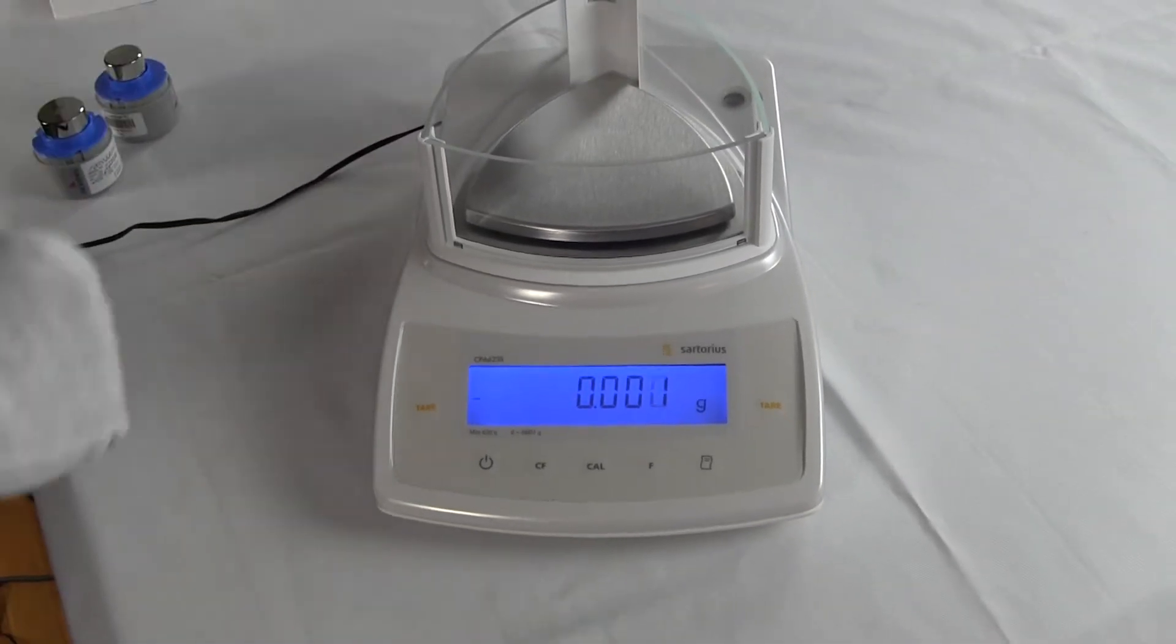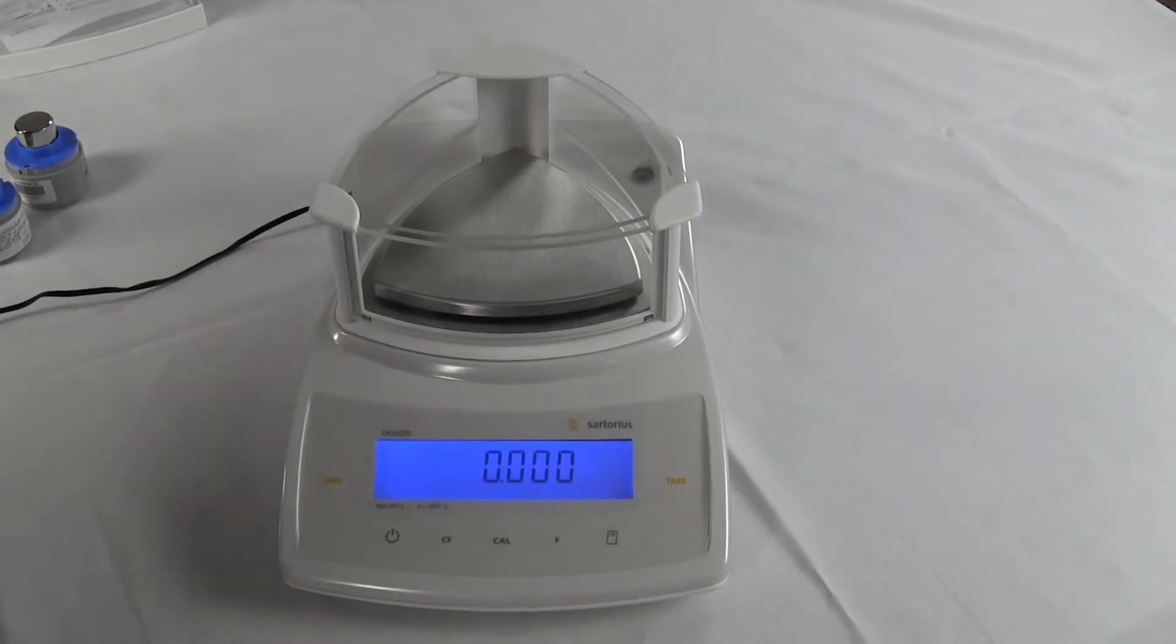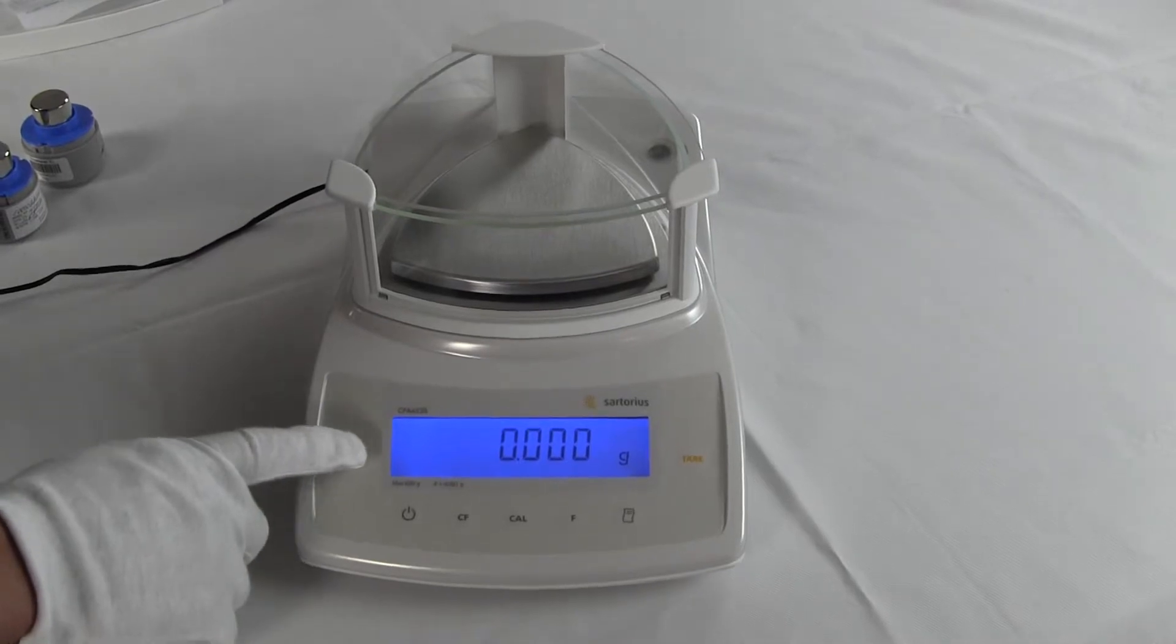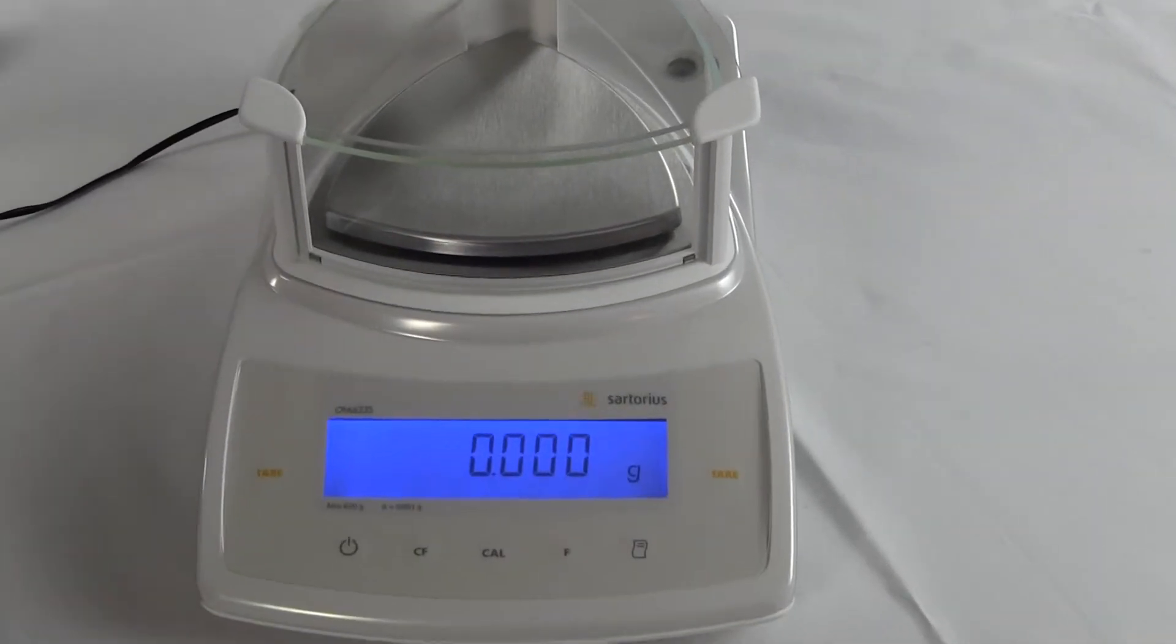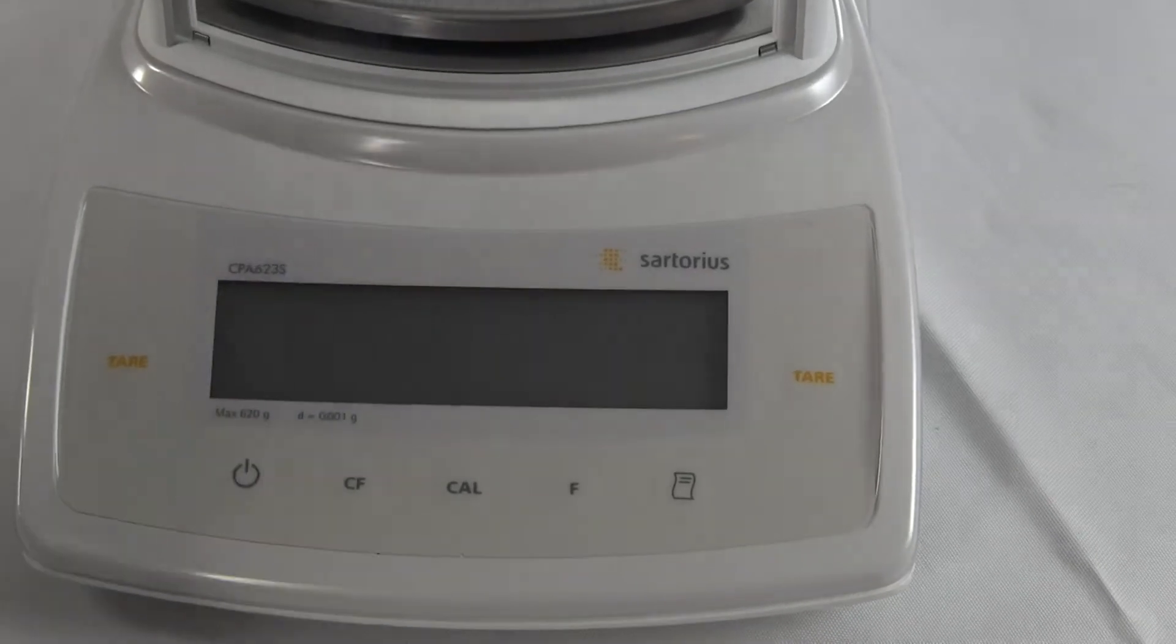I want to go over a few more of the features on this balance. You'll notice the balance has a backlight display. This is adjustable in the menu. We have two tare keys on the right and the left for simple operation. The button here all the way on the left-hand side, this is the power button.